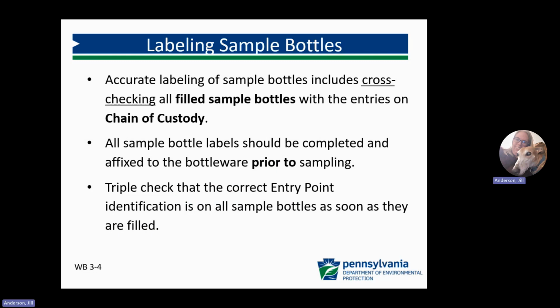When it comes to labeling your sample bottles, make sure all sample collection information is filled out properly and completely to ensure proper reporting to DEP. Accurate labeling of sample bottles includes carefully cross-checking all filled sample bottles with the entries on the chain of custody.